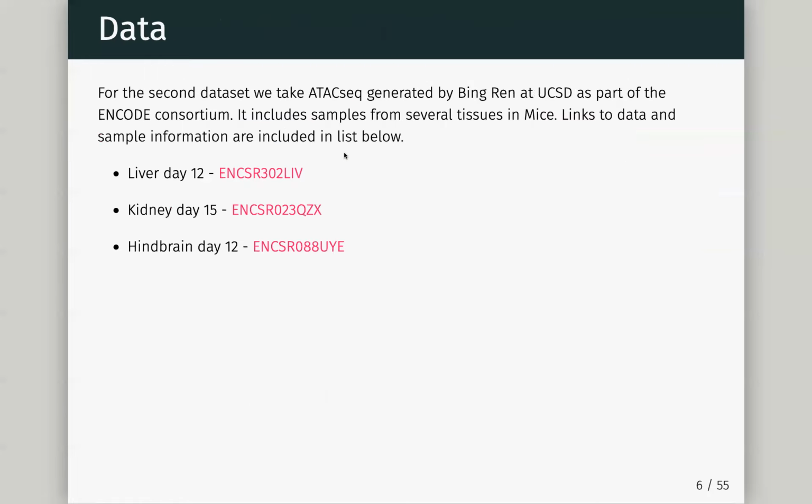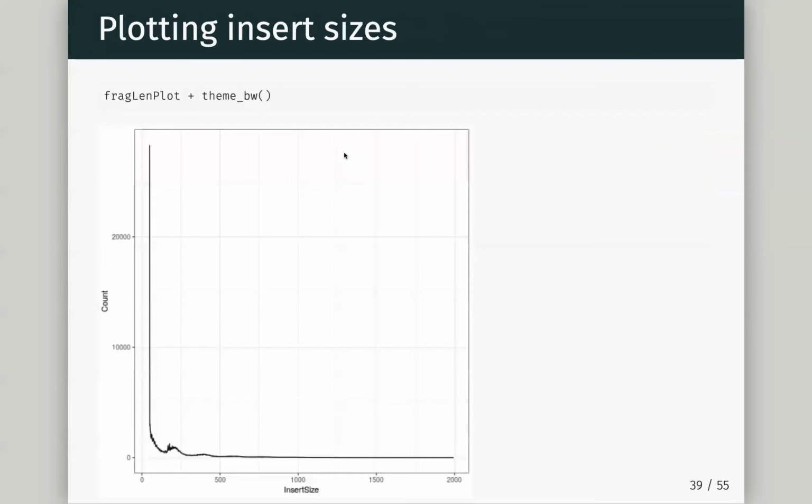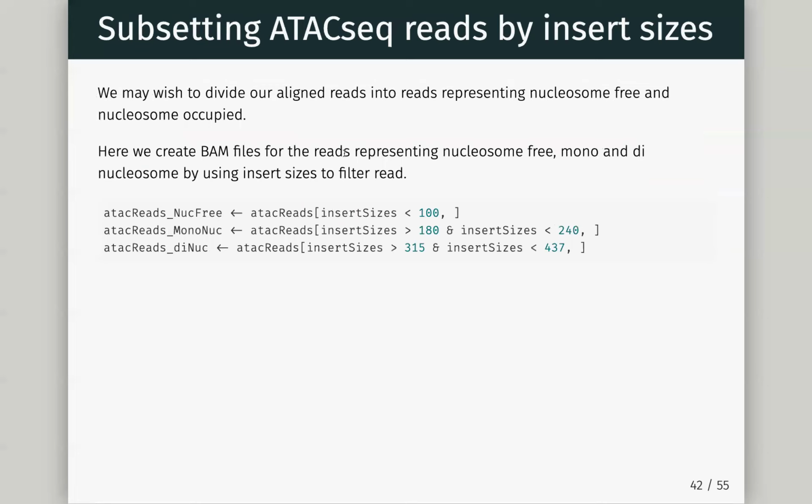What a lot of people do, there will be ones which have come from nucleosome free which end up in other ones just because the size of the fragment happened to be too long. But you should be able to clean up your nuke free by getting rid of longer fragments, right? They can't have come from nucleosome surrounding a nucleosome at that point.